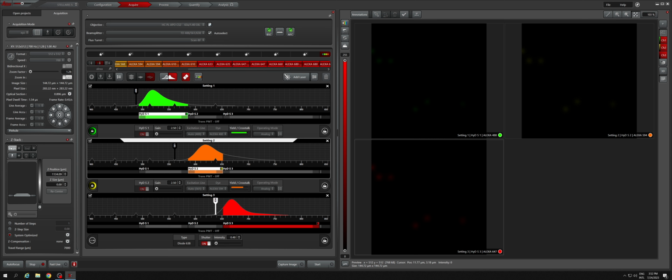So that's looking pretty good there. Then you click begin. So that's setting your kind of start point. Then you just focus the other direction. We'll go all the way back to the other side of these beads. To the center.